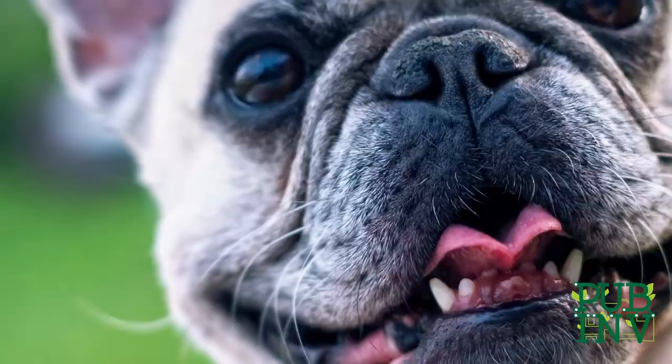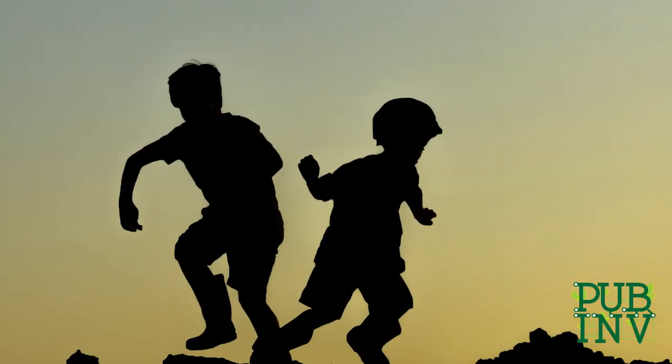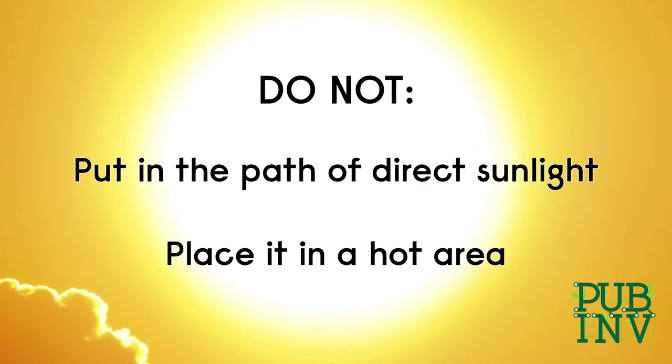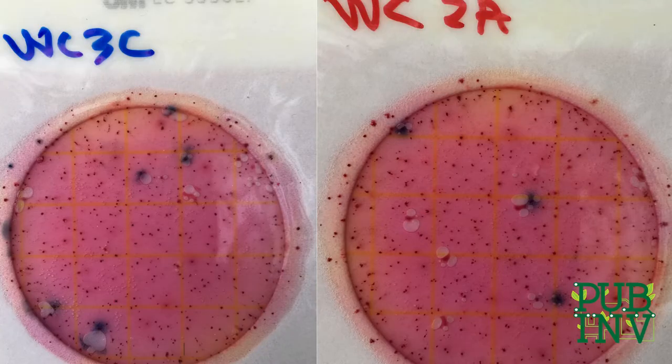Ensure that this is out of reach of pets or younger children. Make sure that it is not in the path of direct sunlight or exposed to high heat, as this could sterilize the sample and cause no results. A dark place such as a cabinet or a box would be ideal. Don't forget about your petri films.